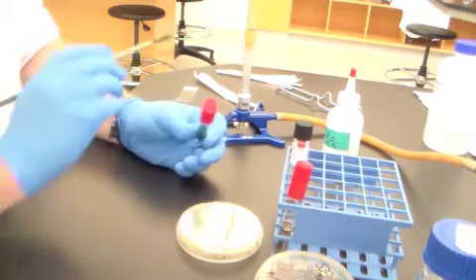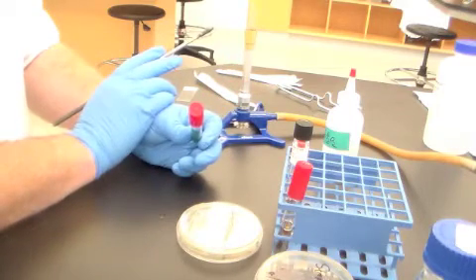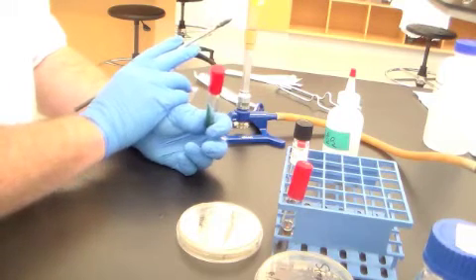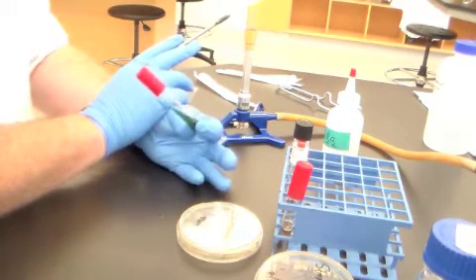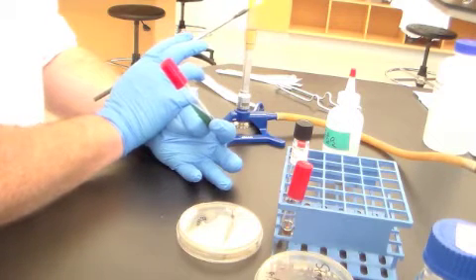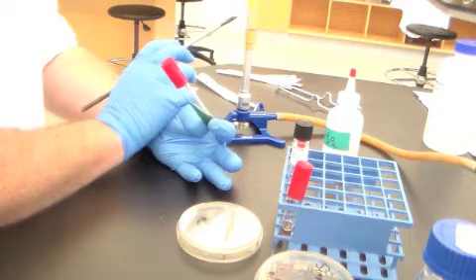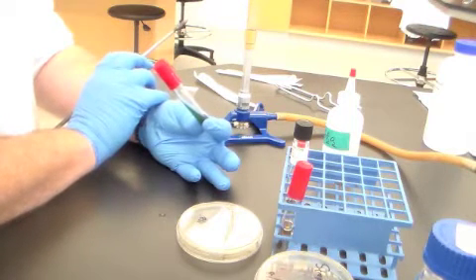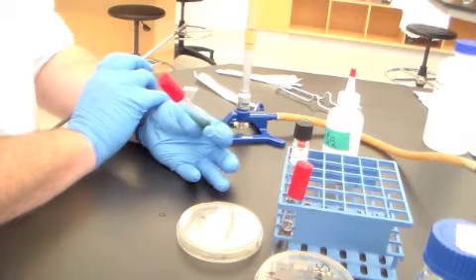The only other media that you need to inoculate this week is a very simple media. This is actually one of only 2 examples that we use in this laboratory of a completely chemically defined media. We know the precise makeup of this. The TAs for the laboratory have made this up to excruciating detail, so we know to the molarity every ion that's in here.